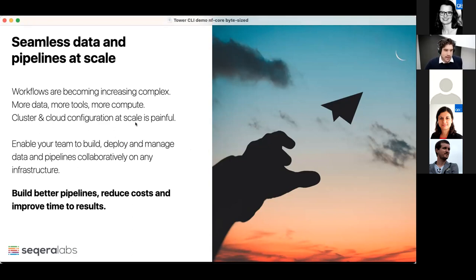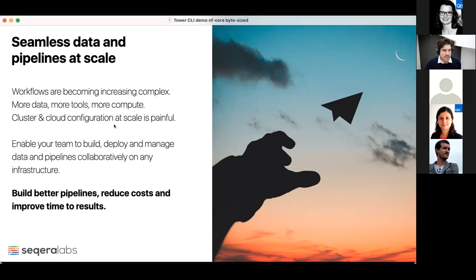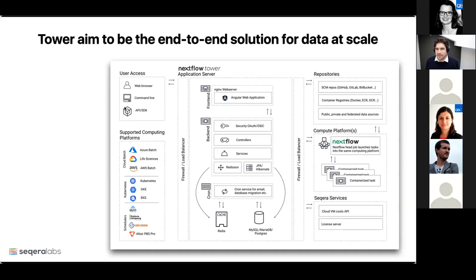This should be a bit of a show-and-tell session with some examples of how you can do this from the command line. Please forgive me if there are any typos as we go through this, but hopefully it gives you a flavor of what's possible. This is really the architecture of Nextflow Tower — it's a full stack web application that connects with these computing platforms across different cloud providers.